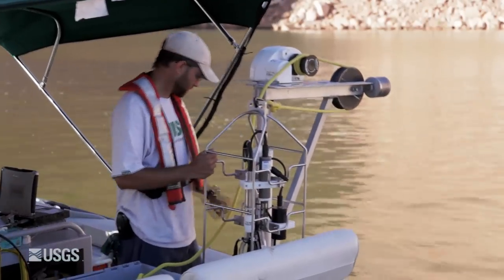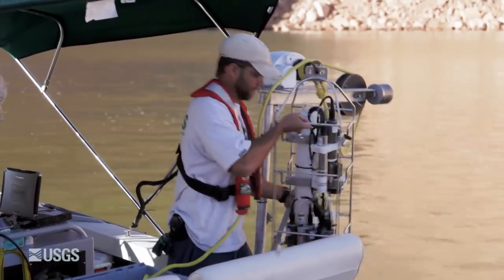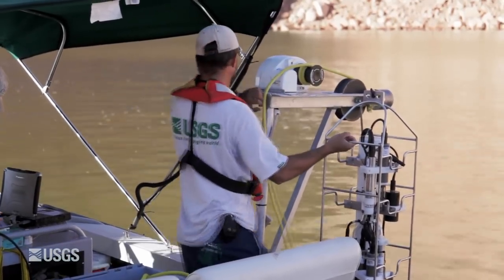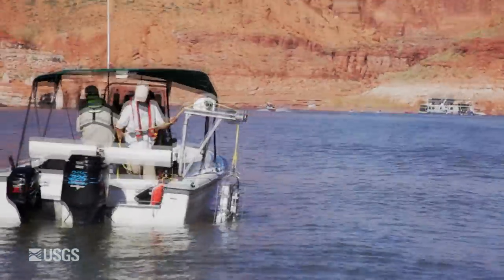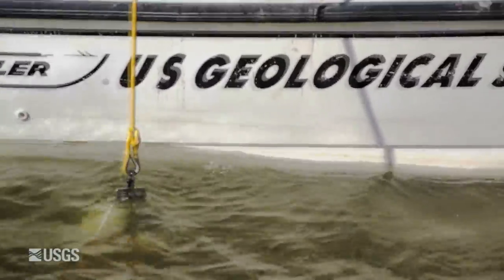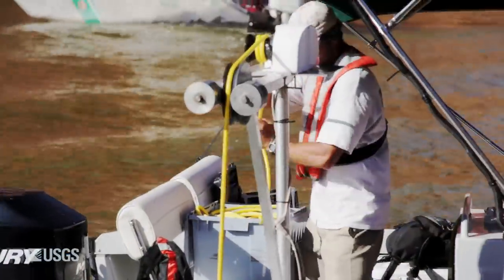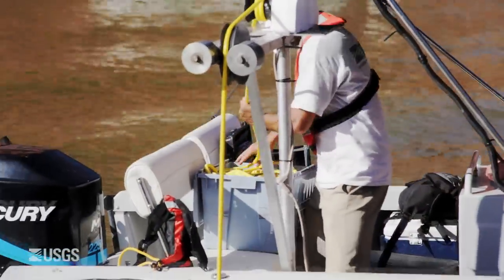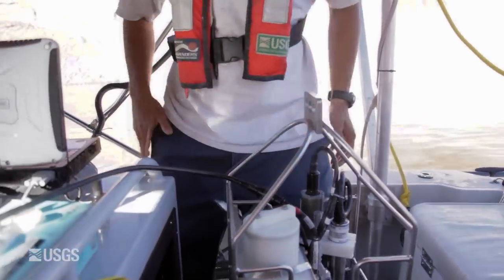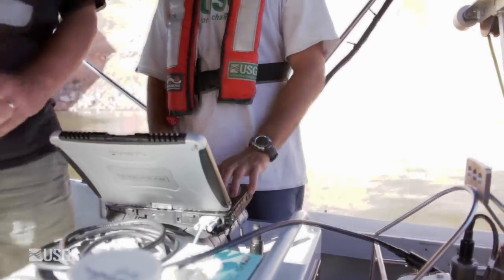This is a Seabird Electronics instrument and it measures multiple water quality parameters. The crew will lower it through the water column at a constant rate, and it will collect data as it falls into the water. It will store all the information in the Seabird and download to the laptop on the boat. Using that information, we decide where we're going to collect water quality samples.